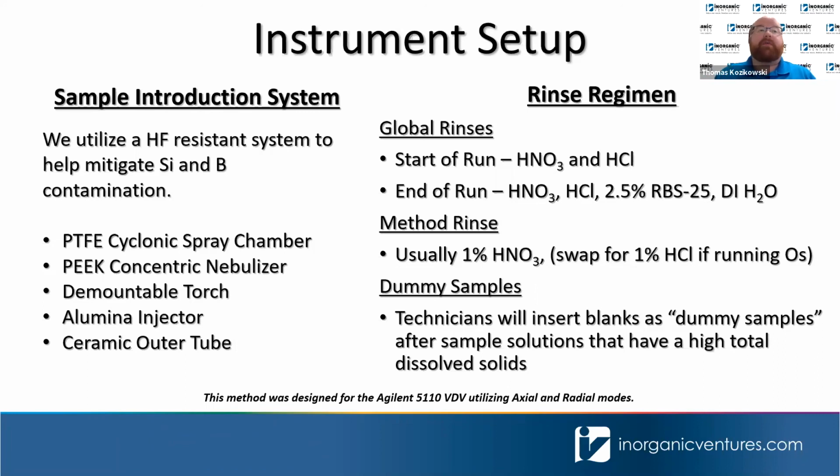That works really well for reconditioning the spray chamber. Even if it's glass or PTFE, that works really well to keep it wetting properly so that you can do less hardcore maintenance offline. But that works best if you do a final rinse of water. So I think we have like 6 water samples at the end of the run and then another 10-minute final rinse.